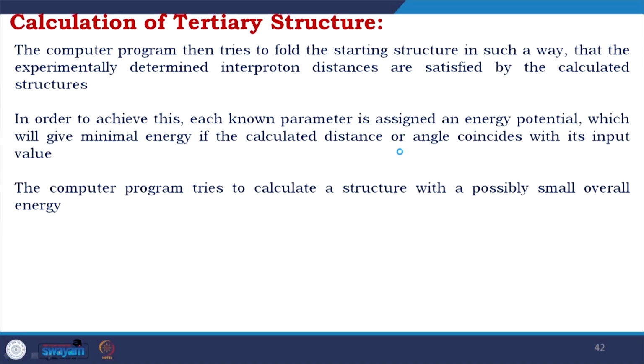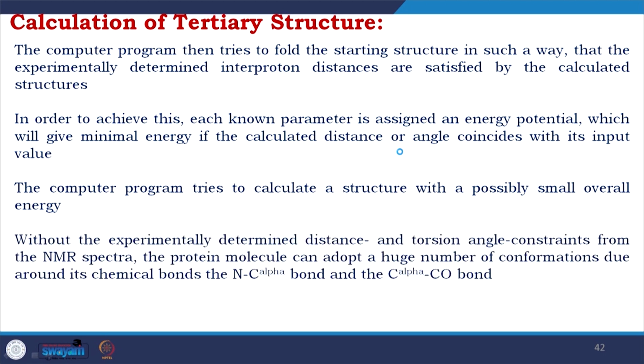Here, in a similar way, you develop a cutoff and you start assigning those parameters and you keep refining them. By refining, I mean go to the minimal energy. The computer program tries to calculate a structure with a possibly small overall energy.